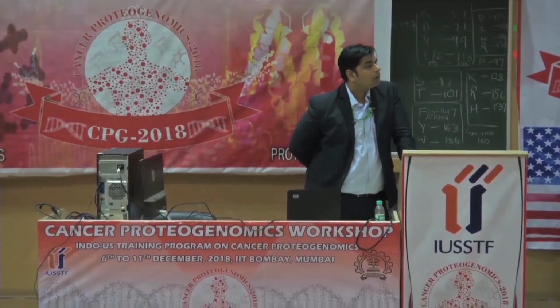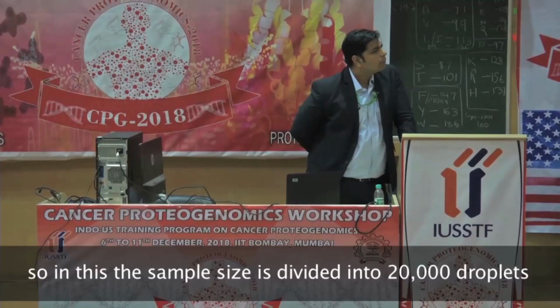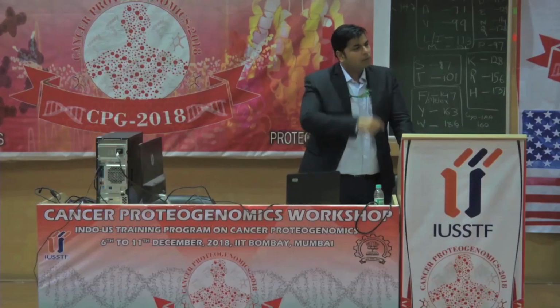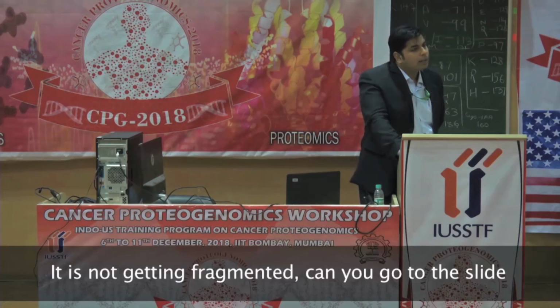In this, each well is splitting a particular sample into 20,000 droplets. Yes, each of your reactions. Like DNA will be divided into 20,000. So how can we... DNA won't get divided. Your DNA is not getting fragmented. It's getting separated.